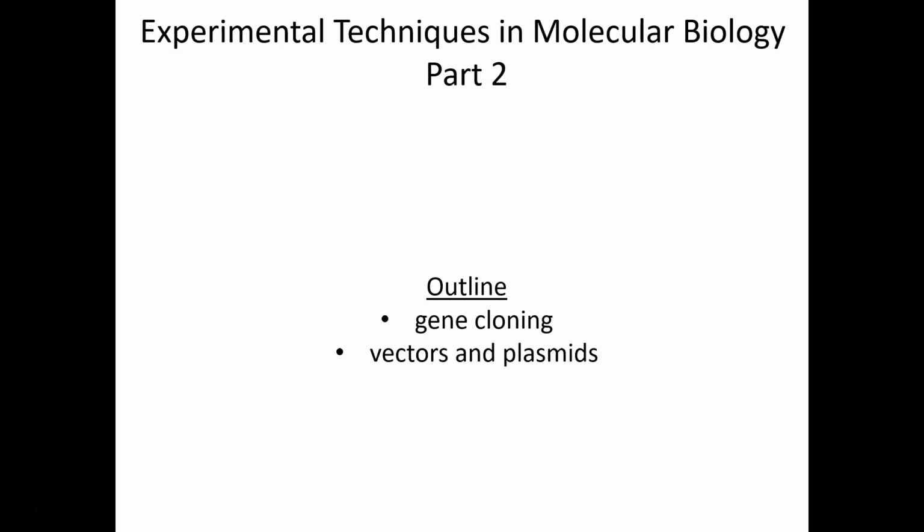Well, hello everybody, and welcome to the middle lecture of Unit 2. We're going to continue talking about experimental techniques in molecular biology and build on some of the concepts that we talked about in our first lecture of this unit, namely PCR. So here we'll be talking about gene cloning specifically, and every other subtopic will relate to cloning genes.